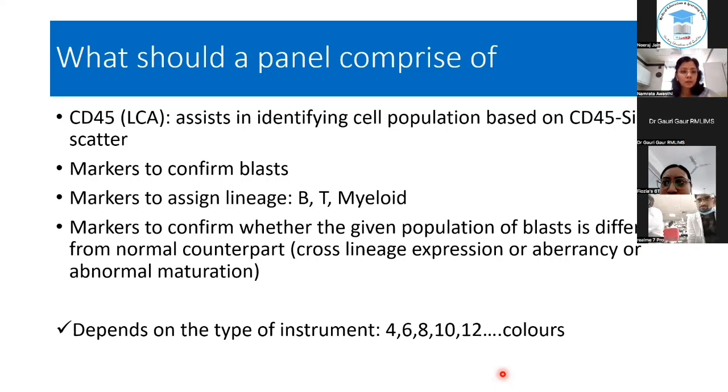And how extensive your panel can be depends on the type of instrument which you have, whether it is a 4-color, 6-color, 8-color, 10-color, 12-color, and so on. So obviously, the more markers you can add to a tube, the more extensive your analysis can be.